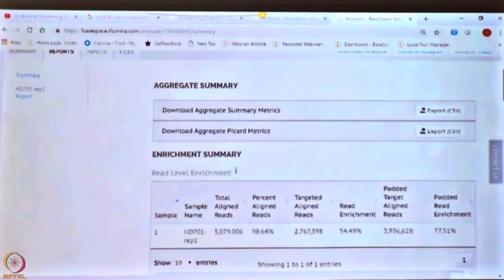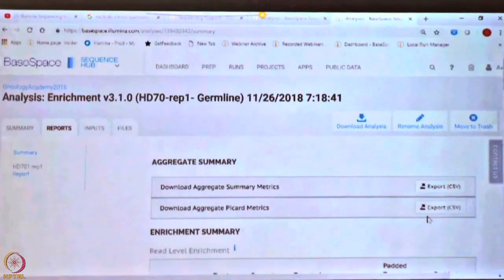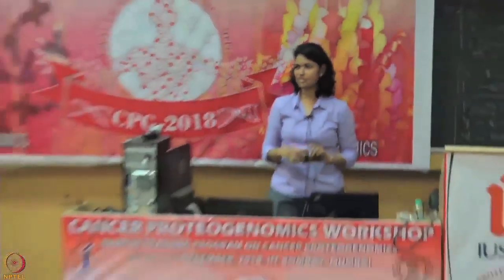The output also shows median fragment length and other metrics. If you download some of this data, you will be able to see the specific variations that are called. We have looked at NGS data generated on the Illumina platform, seen how we can share data amongst collaborators, run some analysis, and looked at what the output may look like. Since you all now have BaseSpace accounts, there are many public datasets available. If you go to the public data section on BaseSpace, you will see thousands of datasets. You can explore those at your free time and reach out if you have any questions. Hope you found this session useful.